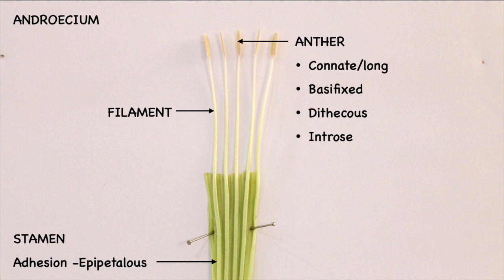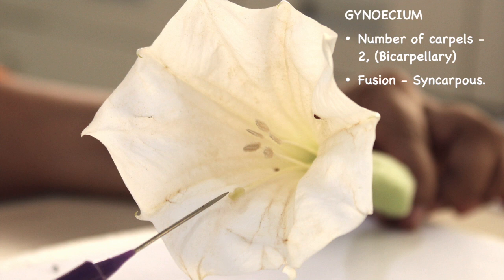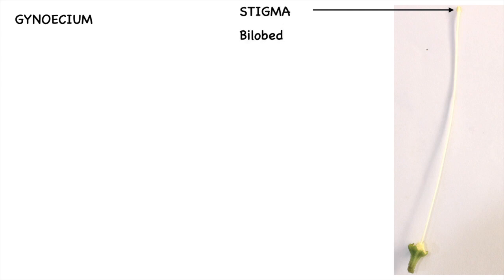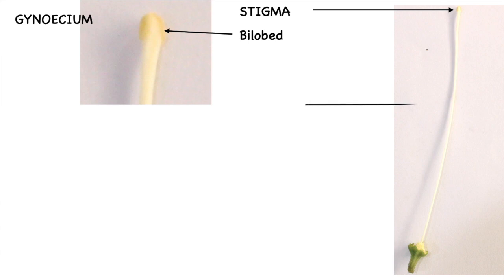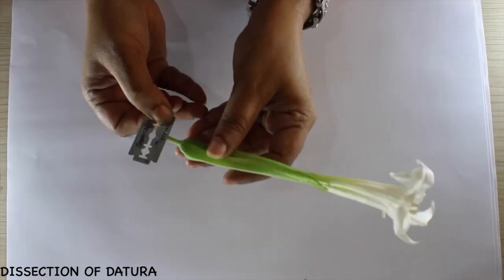The gynoecium shows the presence of two carpels, that is bicarpillary. They are fused, hence syncarpous. The gynoecium shows the following parts: the stigma, which is bilobed — you can see two lobes clearly — the style, which is long, and the ovary, which is superior. In the case of Datura, the carpels are placed obliquely.